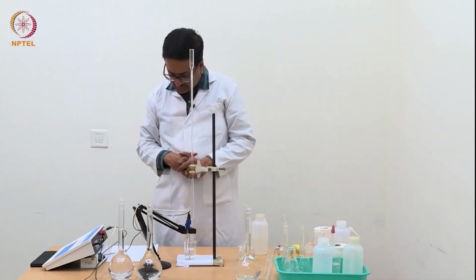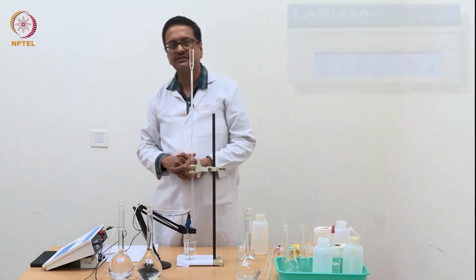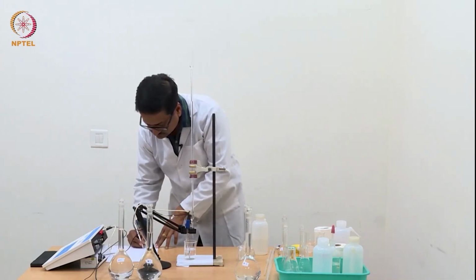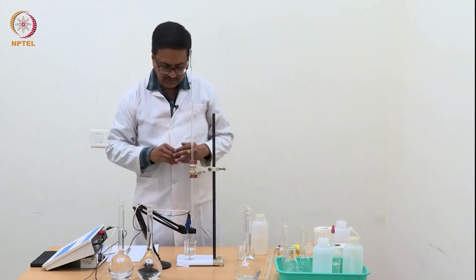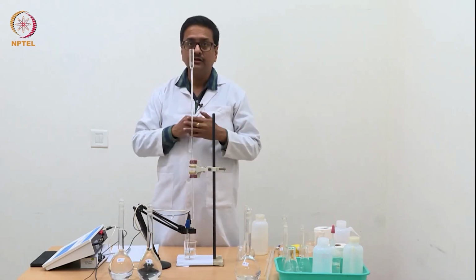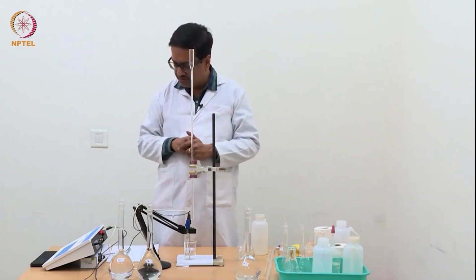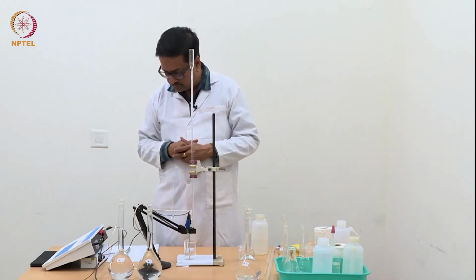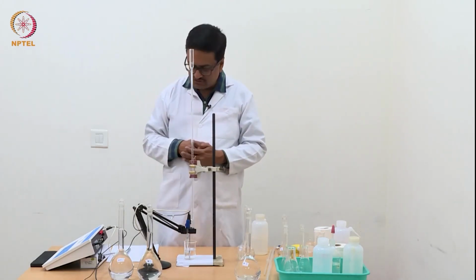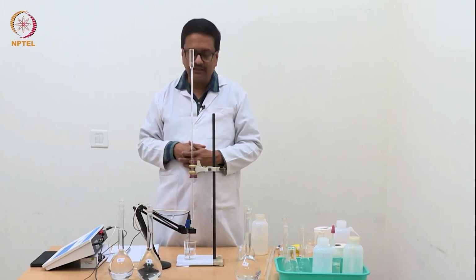So now I have reached a point of 1.3 ml where you can see the pH has increased to 6.23. What we can notice here is that in case of HCl, this increase towards the equivalence point was sharper than this one, and it is gradually jumping from 5.44 to 5.82 to 6.23 over a range of about 0.2 ml, that is between 1 ml and 1.3 ml.